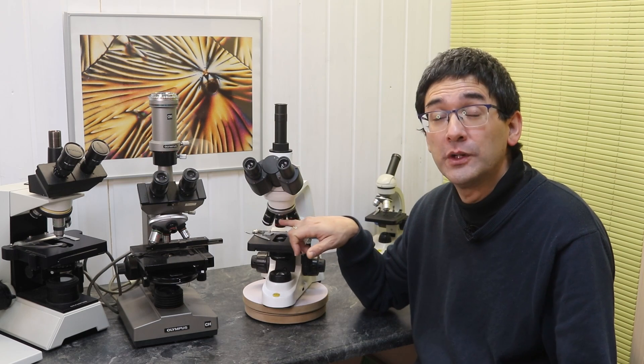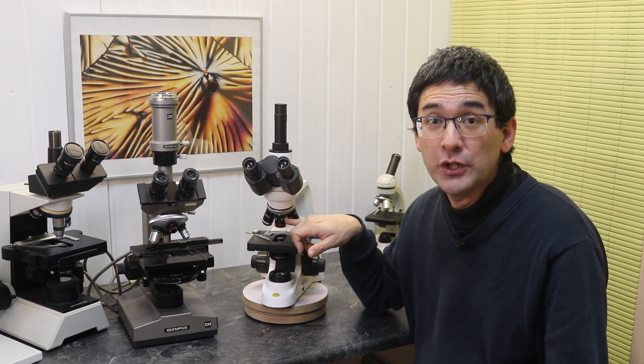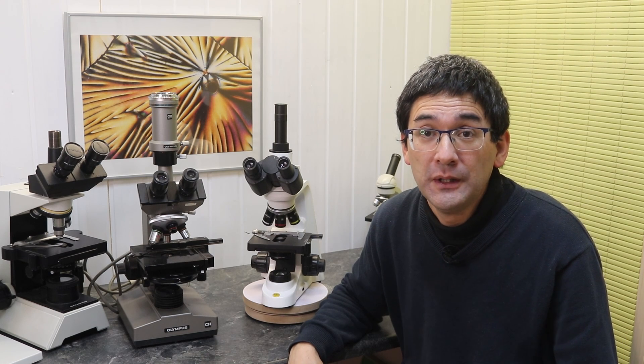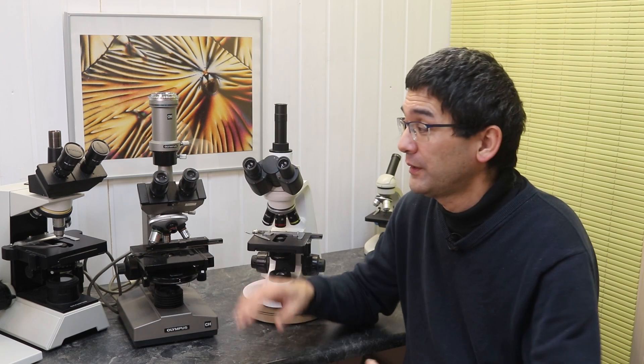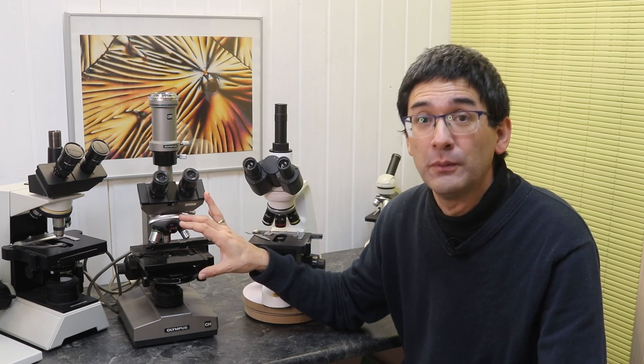Let's say that you would like to exchange one of those infinity objectives, get a 20 times objective or a 60 times objective that the microscope doesn't come with. Are you able to get those objectives or not? So these are the issues.